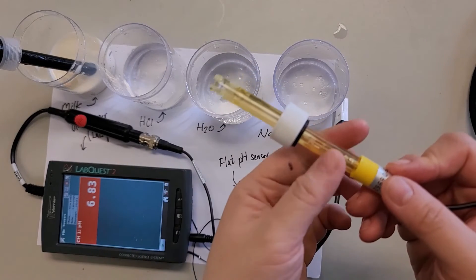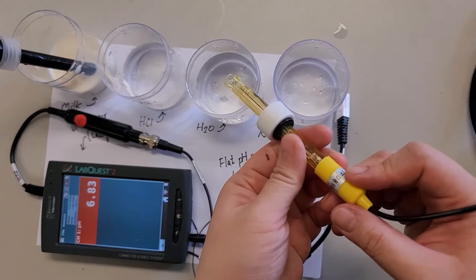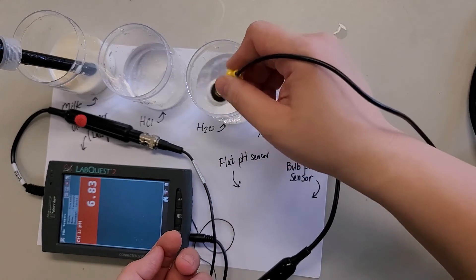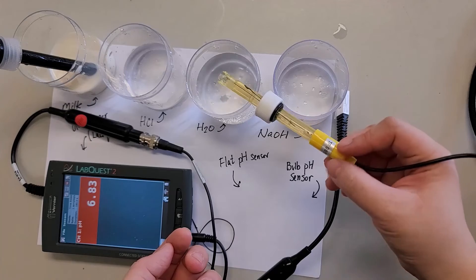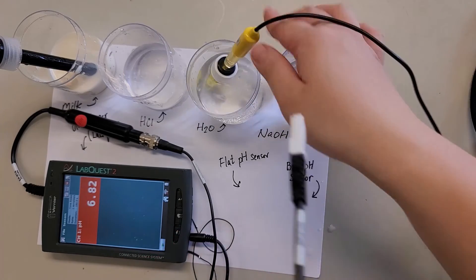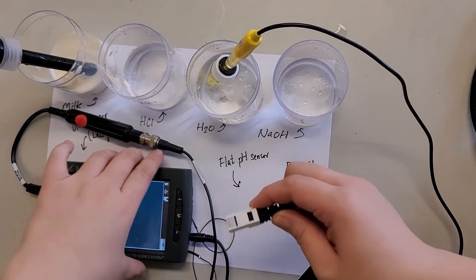Again, we need to make sure the bulb is submerged in the buffer solution, make sure it doesn't dry up. Because you think about it, pH is actually measured inside a solution, so it must not dry up. Now I'll put this one into the sensor now.